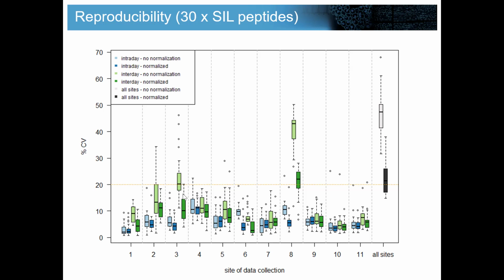We just did some kind of top 3, which is not the smartest way to do it, right? There's certainly smarter ways to select which peptides you want to use to do protein quantification. I think that's also going to come up tomorrow. So I think that there are tricks that can be played in the data to improve this too. But yeah, I think the short answer is yes.